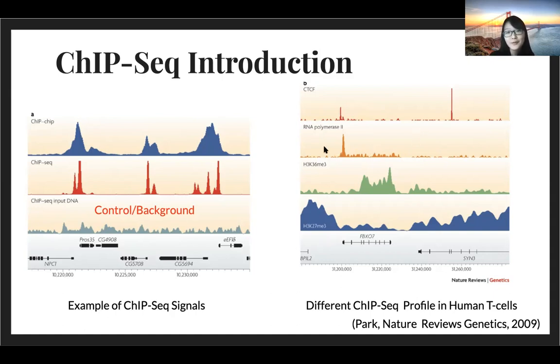For RNA polymerase II, you will see much wider peak signals. For histone modifications, it's much wider and much deeper signals compared to transcriptional factors. We keep saying peak calling for ChIP-Seq because it's like small peaks when there is a binding event at a specific location.